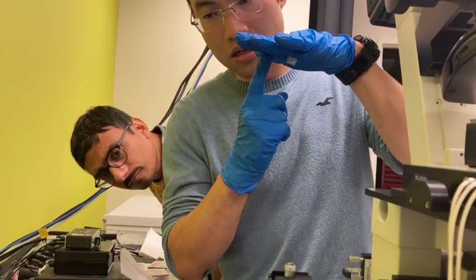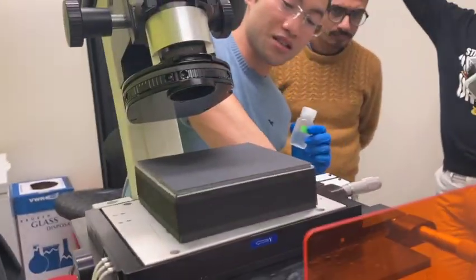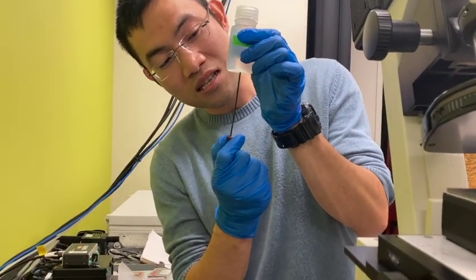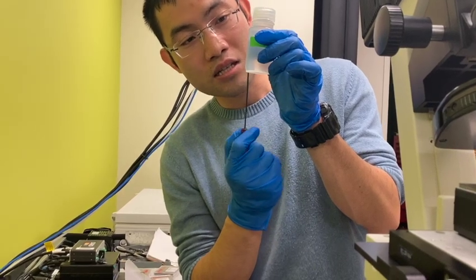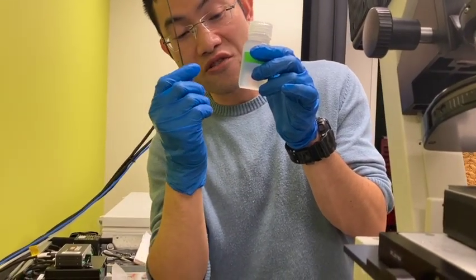hits the objective. So let's say this is our objective, and we have our laser. Where's my laser? So this is our laser beam. If your laser goes into the center of your objective, it's going to go all through because there's no total reflection.